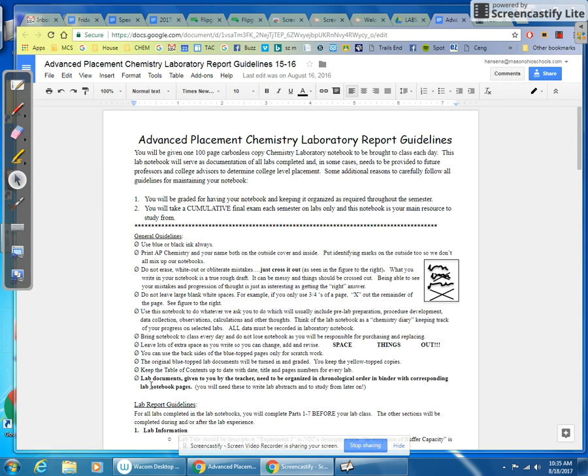Ooh, I almost forgot. Little tip about using your lab notebooks. As you guys noticed, you make a carbon copy of your lab when you write in it. So I'll say this real quickly. When you look at page 1, for instance, there's a white page with a blue heading, and then following that is a white page with a yellow heading. The yellow page is the copy. Okay, so when you want to write in your notebook, you take the blue and then the yellow that follows it, okay, and then put the flap in between.